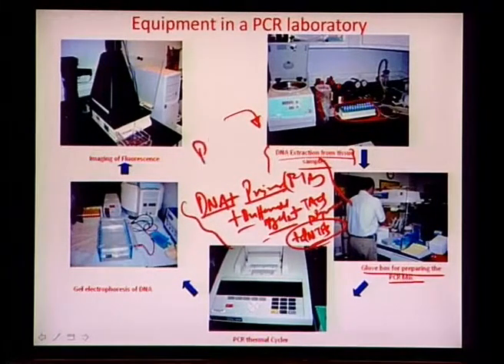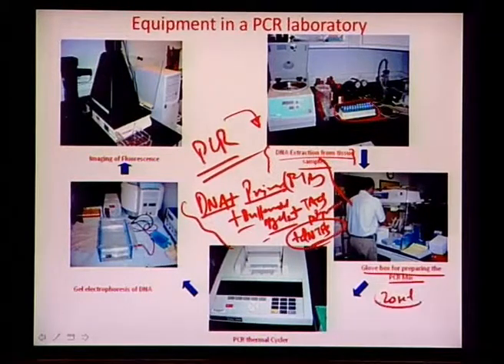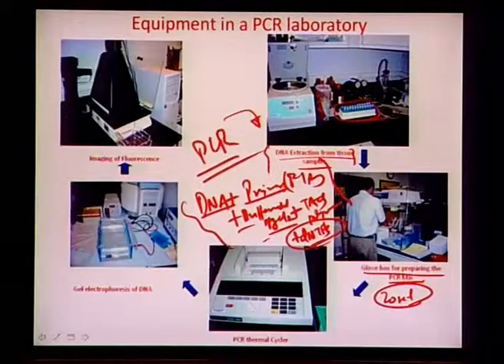I have already talked in detail about PCR before, so I need not give any illustrations here, but the sample is mixed in about a 20 microliter vial made of polypropylene, which is highly hydrophobic. These are then centrifuged and vortexed repeatedly in sequence, so that the mixture diffusively mixes before we start the thermal cycling process.